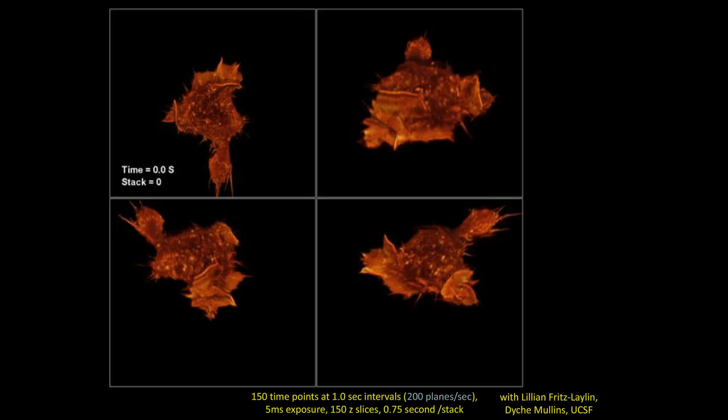You can see the cell is curling on top of the cover slip. And if you look at all the different view angles, we didn't have any spatial resolution distortions. So simply we can get isotropic resolution and this kind of subcellular resolution. Most important, if you look at the timestamp, we can finish a 3D imaging in sub-second, less than a second. We have a 5 millisecond exposure and 150 Z slices. So we can get a very good temporal resolution for this kind of phenomenon.